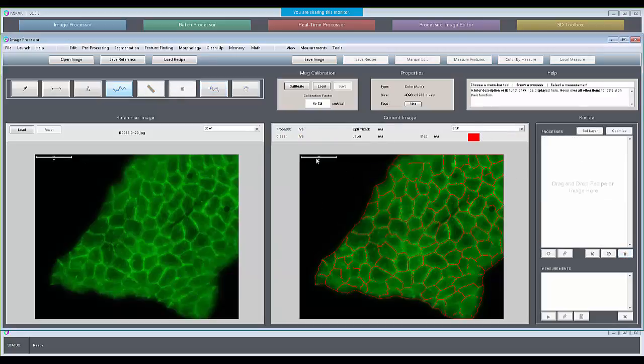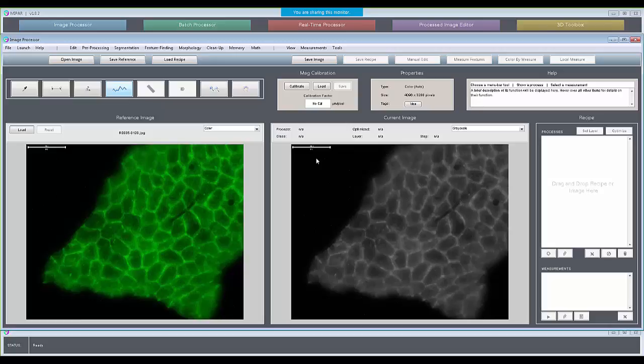So it's a pretty high resolution image here. We've got 4,000 by 3,000. My feeling is I don't really need all of those pixels for this type of analysis. I think downsampling is fine. It's still going to leave plenty of pixels per feature, and there's enough uncertainty in the rest of image processing without worrying about whether you've got 1,000,000 or 10,000 pixels in one of these cells.